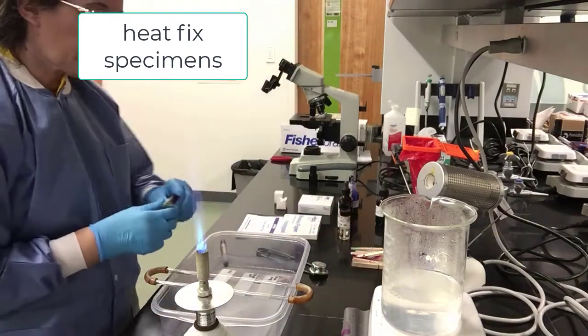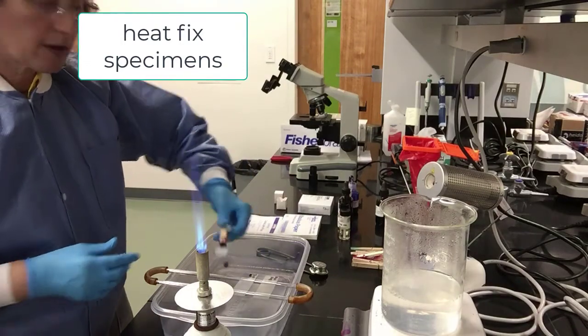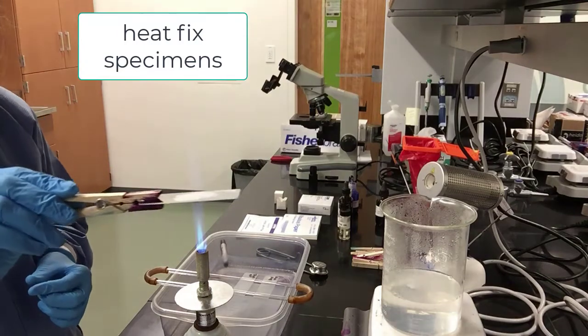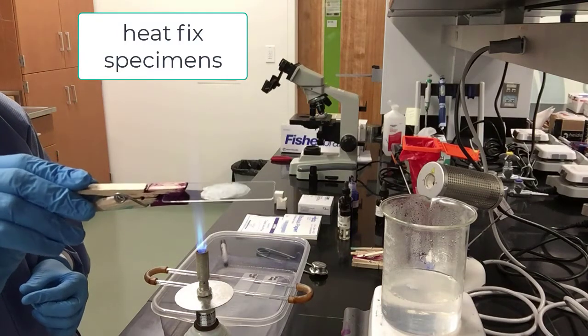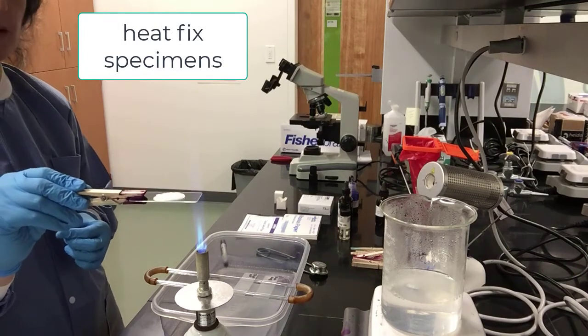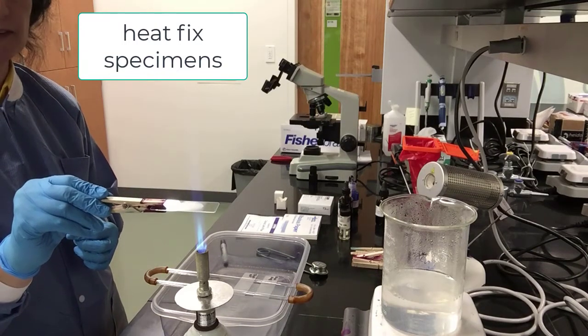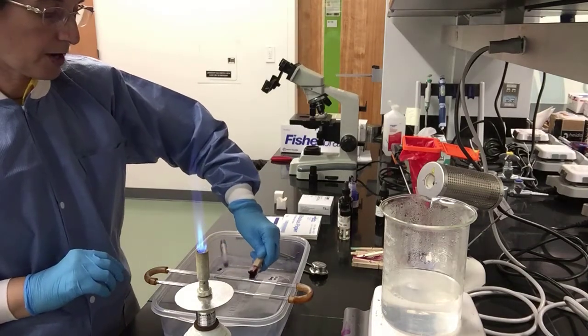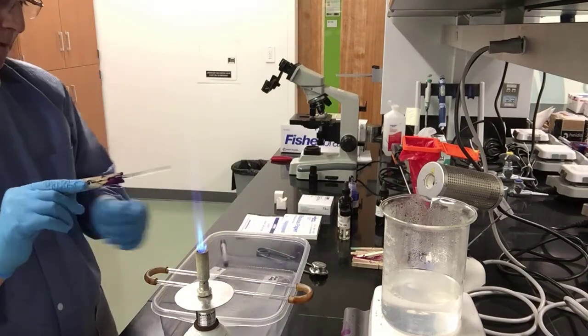So we light our flame, and with a clothespin, very carefully, we pass the slide over the flame for about 3-4 times to make sure that we heat fix the specimens. Now we can move on to the next slide.